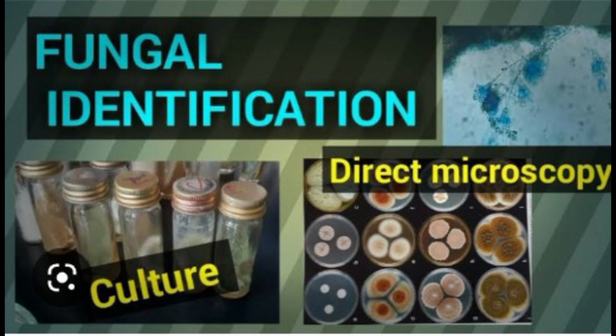Gram staining. Gram staining is used to identify yeasts, which are Gram positive. The morphology of yeast growth on SDA is similar to that of bacterial growth. The preparation of the smear from the growth and the procedure of Gram staining are similar to those for bacterial growth. The observation is reported as Gram positive yeast or Gram positive budding yeast cells, depending upon your finding.